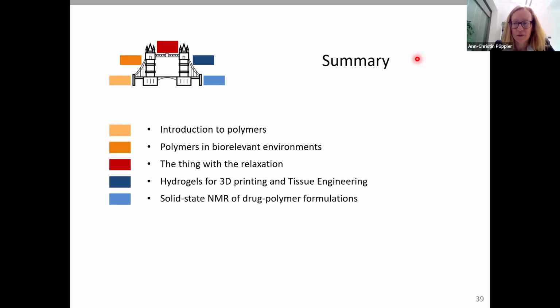I think what makes this complicated is that the release is certainly an important factor that we need to take into consideration. And we can, for example, see also in the DOSY, in these comparisons with different concentration profiles that I've shown, that at some point the molecules must leave the micelle and be associated with the other parts of the mixture.